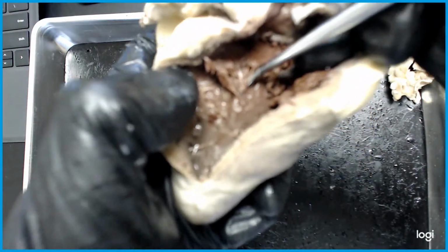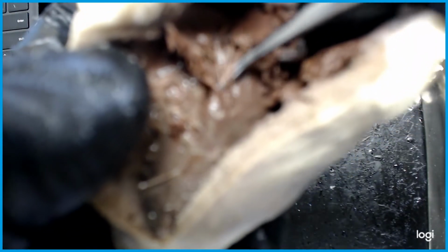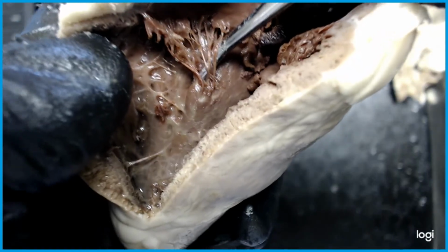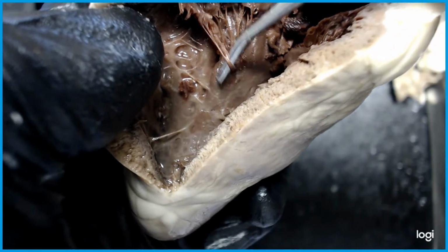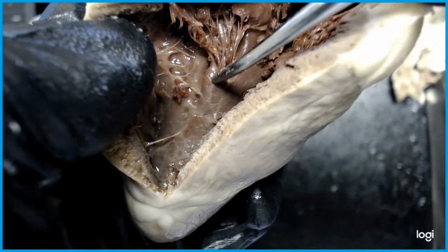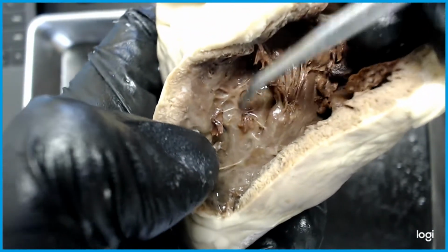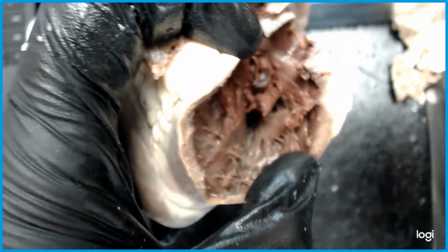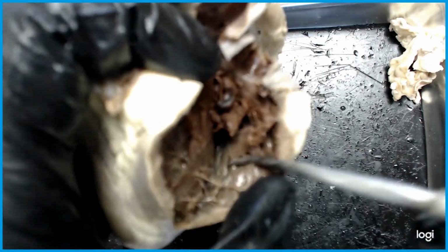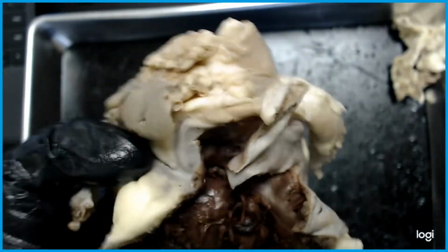Now we can get the focus, see how much closer we can get. In fact, go ahead and turn on the light, see if, now that I'm closer, oh, there it is. Actually, I don't need the light anymore. The chordae tendineae are attached to the papillary muscles, right here. This is what we have. So these muscles they're attaching to are the papillary muscles. In fact, you somewhat see them throughout. These are the papillary muscles. Okay. You can also mention the trabeculae carneae, which is all this section in here.